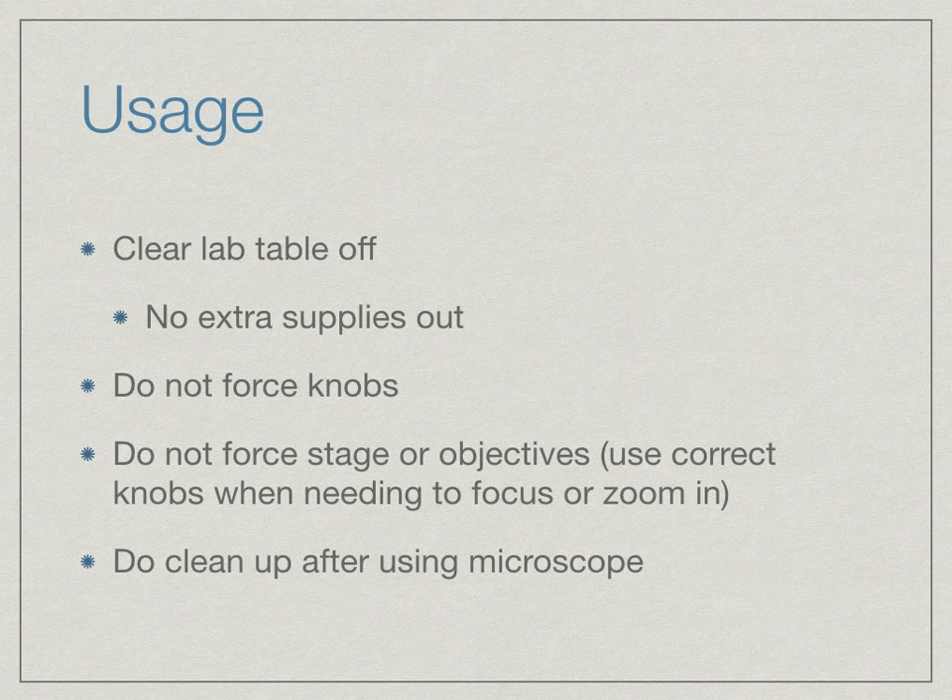Never touch the stage and force it or the objectives. Use the correct knobs or nose piece when you need to rotate through the objectives or when you are trying to focus or zoom in. Make sure once you are done using the microscope and the slides that you clean up after yourself.